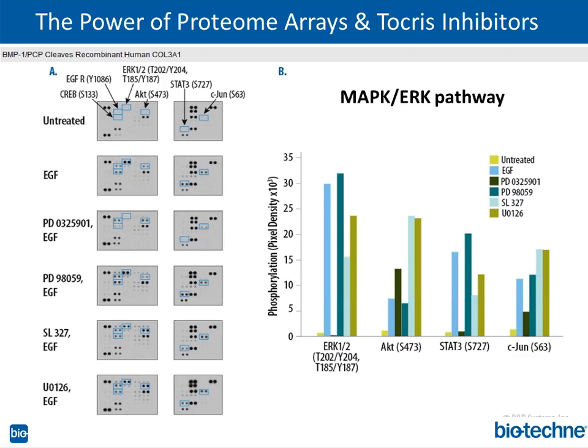And by the way, I apologize, I'm not even describing how these membranes work. But basically, these are membranes that are coated with the capture antibodies already. There's no SDS-PAGE. There's no transfer. It's a nitrocellulose membrane spotted in duplicate with antibodies to multiple targets, intracellular or extracellular.